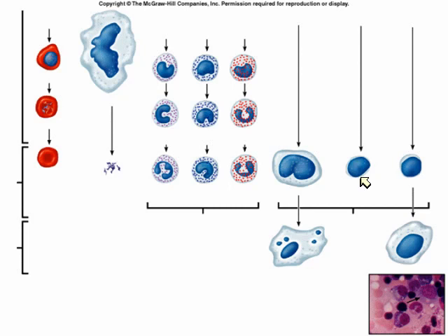Okay, now these last 2 are both lymphocytes. There's different kinds of lymphocytes that you will study in lecture when you get to the lymphatic system. For lab today, in this exercise, we're not going to distinguish between the 2 different kinds. You really can't tell them apart by just looking at them in the views that we see. But we do need to know that they're lymphocytes. Like the monocytes, they do not have distinct granules in their cytoplasm. That's why, like the monocytes, they're called agranulocytes.